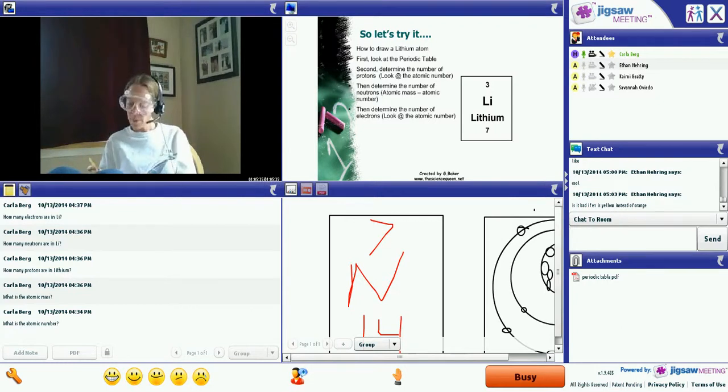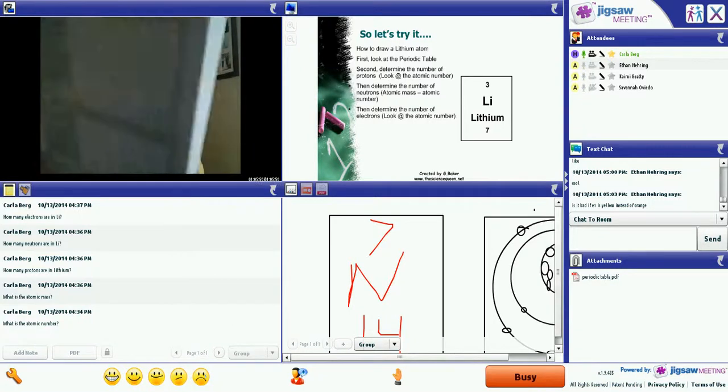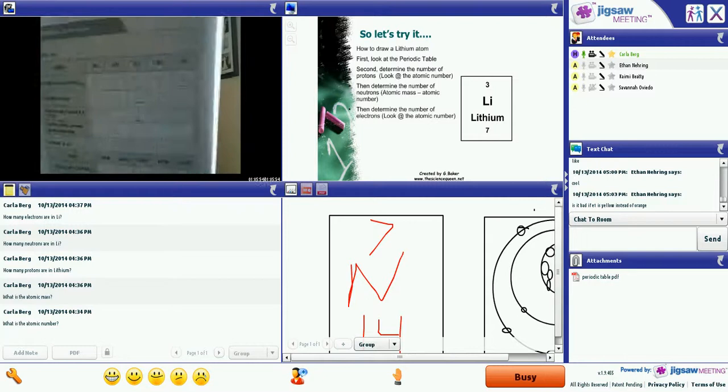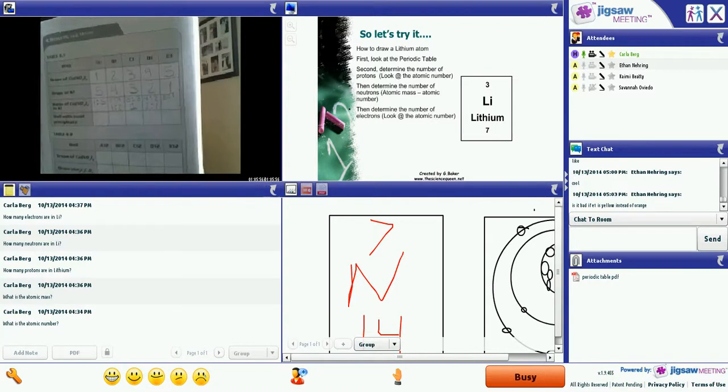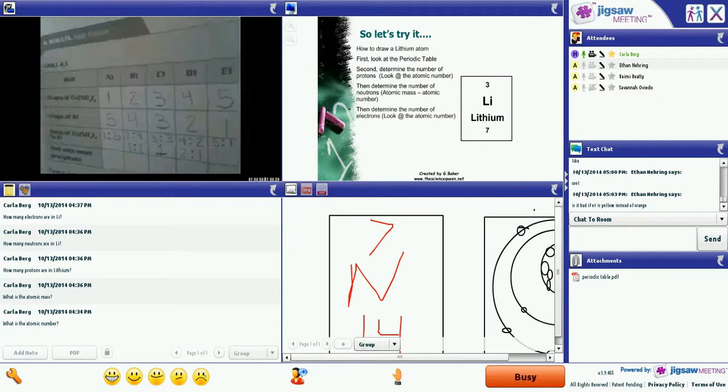And then we are going to do a ratio for E1, which is 5 to 1. So data table 4.1 should be all filled out, except for our bottom row. I'm going to try to make sure you can see this.